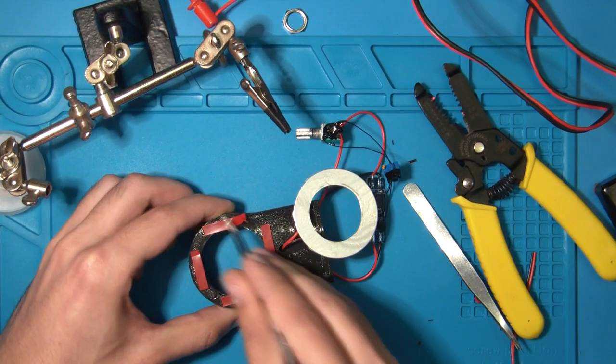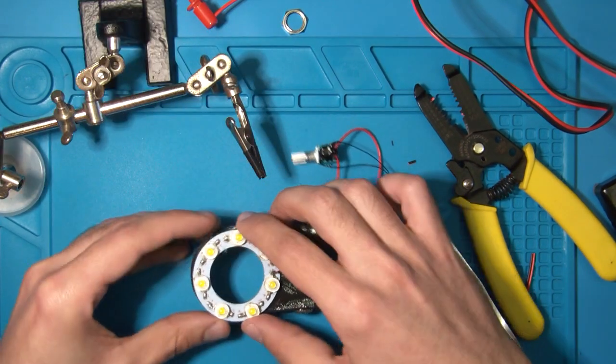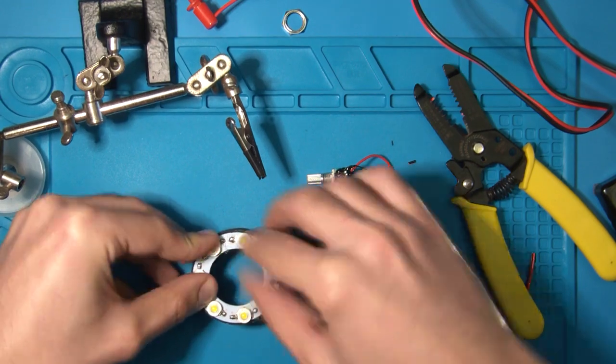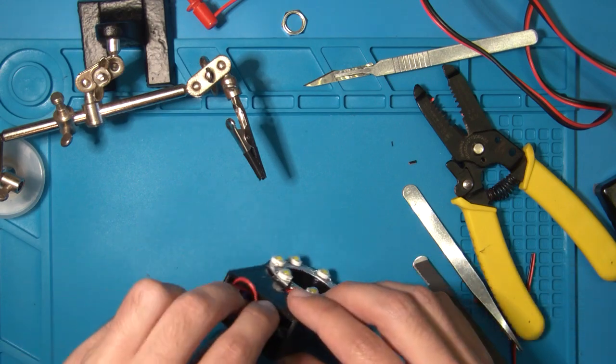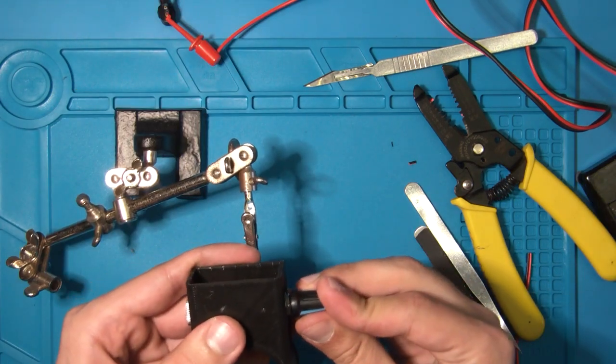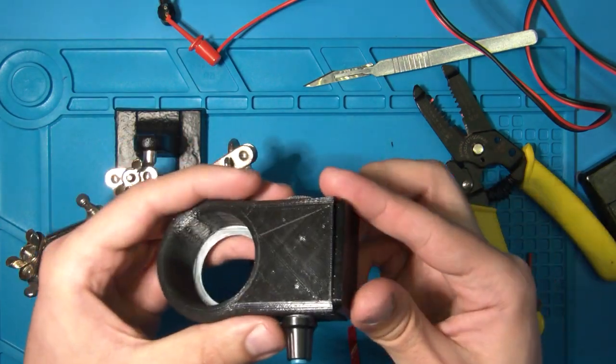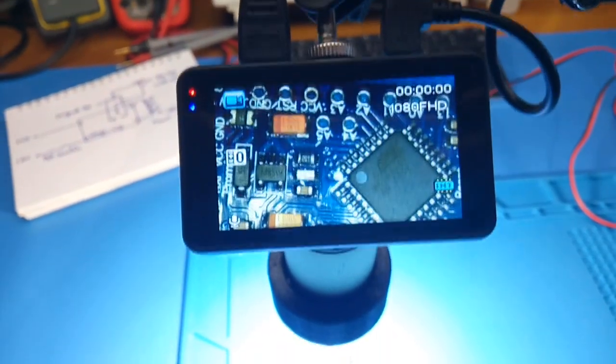To secure the board to the 3D printed enclosure, I just used double sided sticky tape. I mounted everything inside the box, and here is the final result.